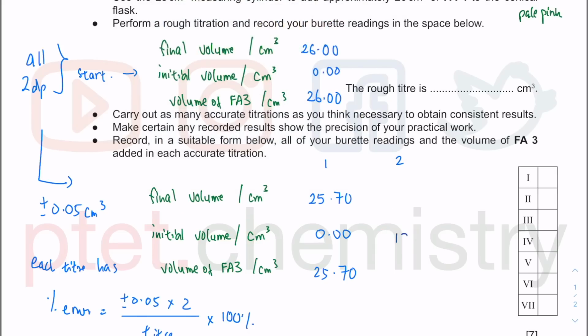And then you could have started the next one from, I don't know, 10.50, for instance. I'm just coming up with random values here. So maybe 25 and let's say 35. Then when I take the difference, final minus initial, I get 25.75. Am I correct? That doesn't look right at all. So how about 36? That looks better, because this one will be 5 minus 0, 12 minus 5, 35 minus that. So that is all right.